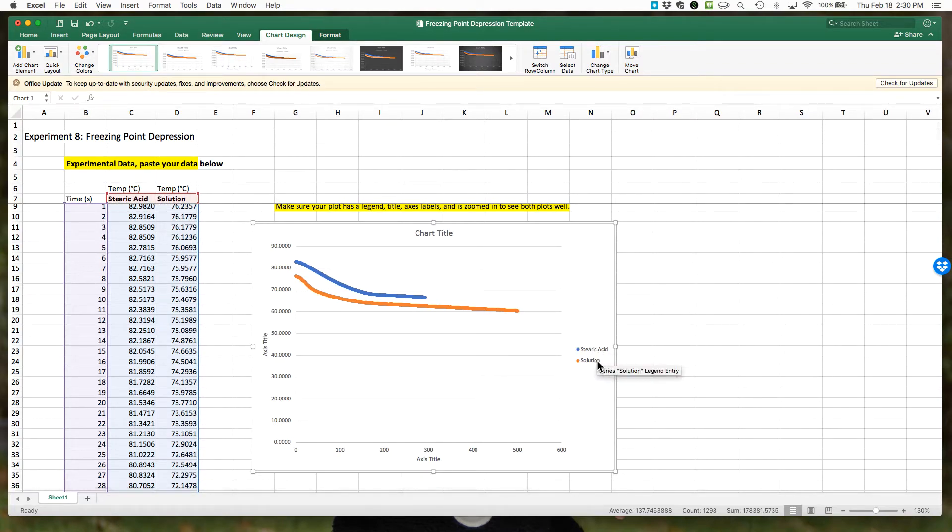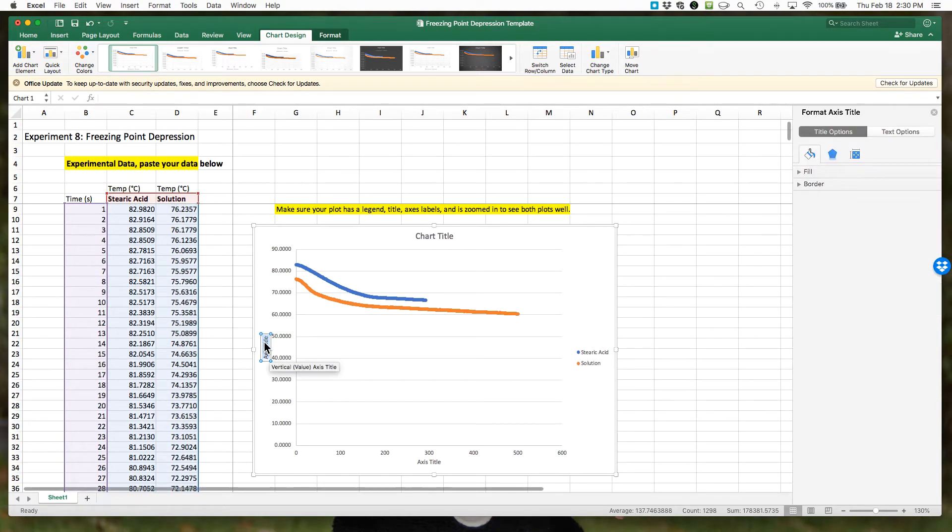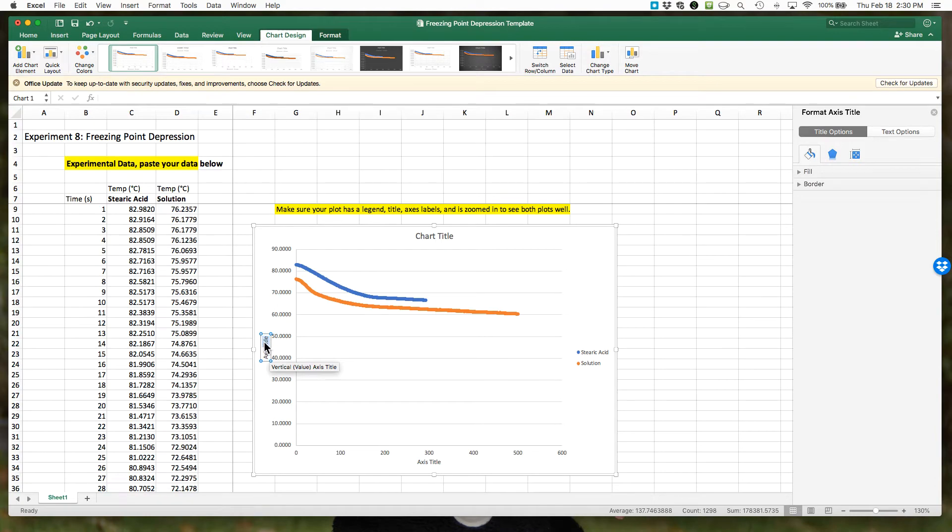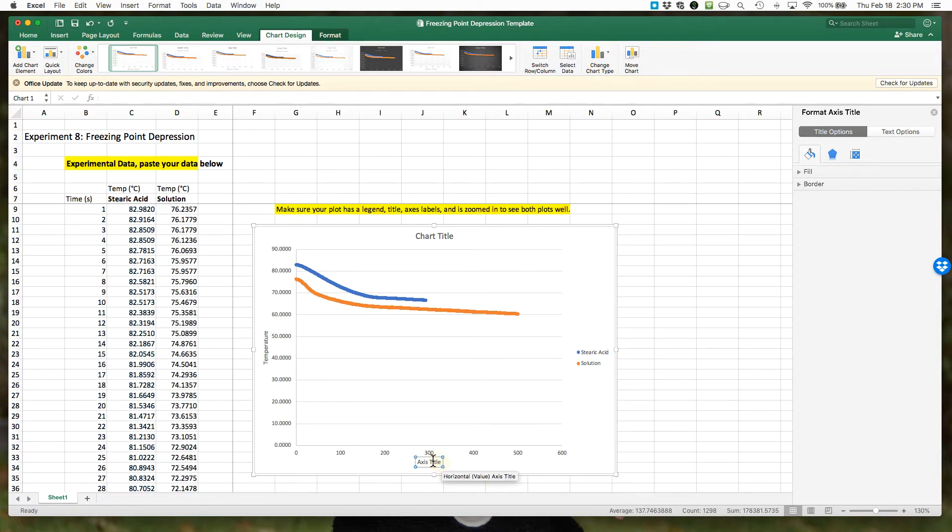Because we have previously highlighted our data, our column headings should be filled in for us. Now you can go ahead and give yourself axis titles by double-clicking into each of these boxes. On this one we have temperature, and on the x-axis I'm going to change it to time in seconds.